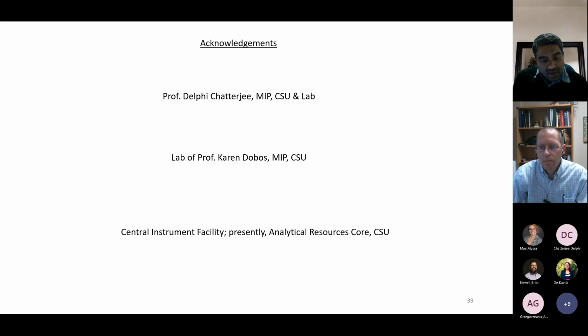It is about knowledge of the molecule and the product stability, because you design or describe your mechanistic pathway based on product stability and bond energy calculations or knowledge. These are new things. This type of fragmentation was not there before. And these are crucial for any future development of algorithms, because computational chemists are sitting there to transform these mechanisms into algorithms for specific cleavages for specific sugars.